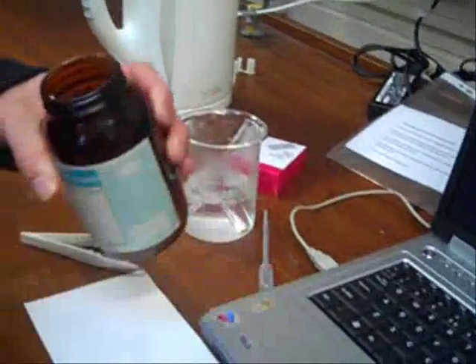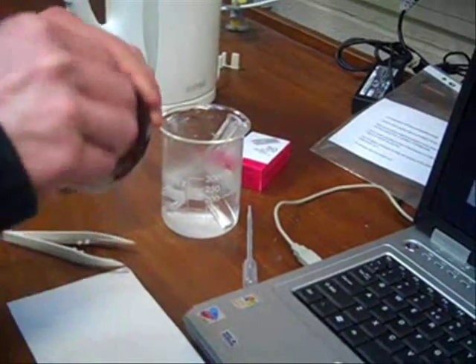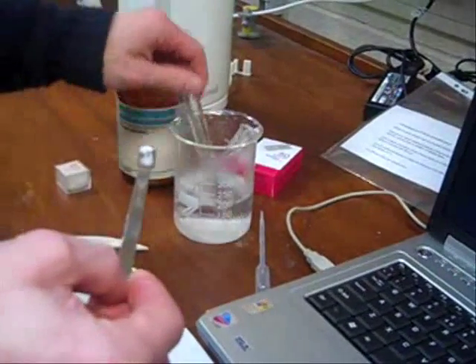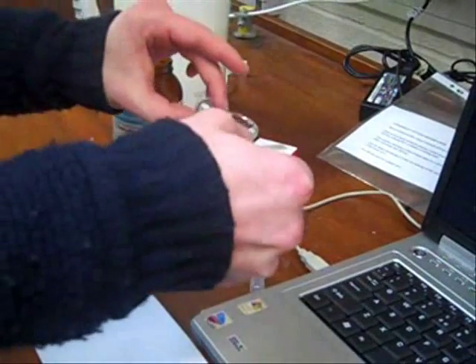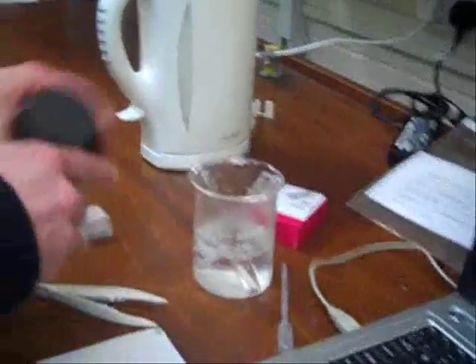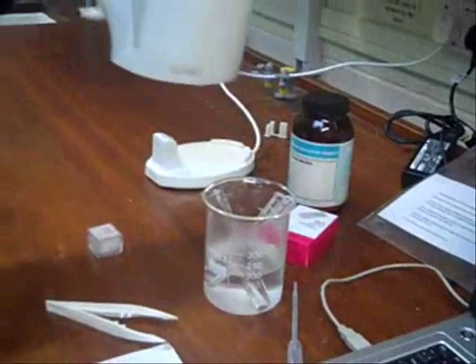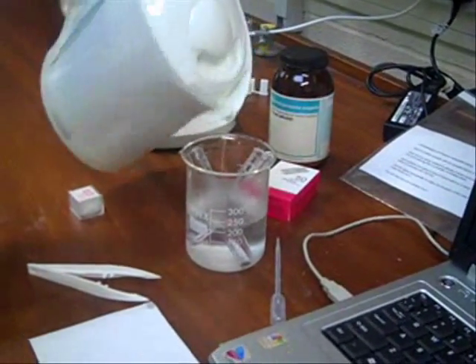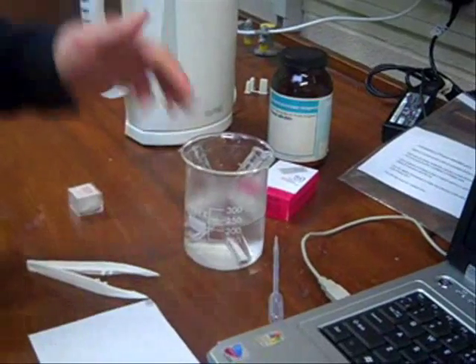So first of all, we're going to be taking some phenyl salicylate and put some in the test tube, carefully replacing the lid, adding some nearly boiling water to the beaker, and the crystals will melt in the test tube by heat transfer.